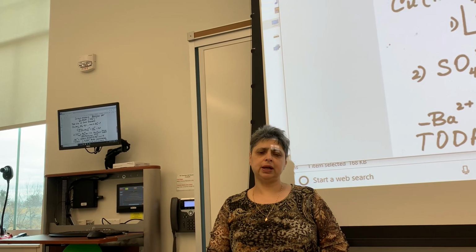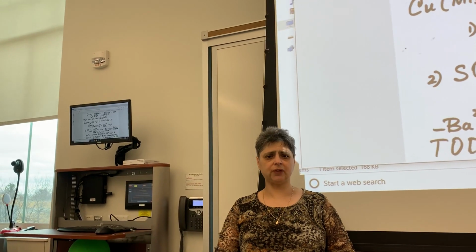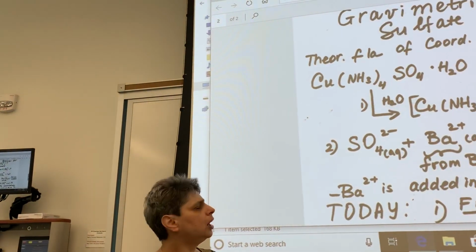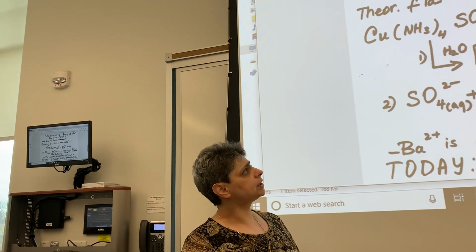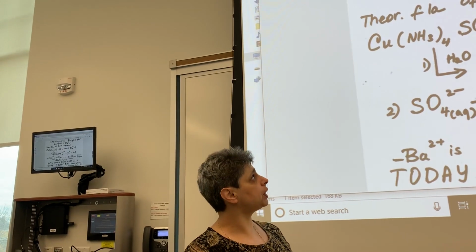Today we are going to finish our discussion on gravimetric analysis for sulfate, and I would like to start by reminding you what happened in the video that I posted for the first week of this experiment. We are now discussing the second and last portion of this experiment.